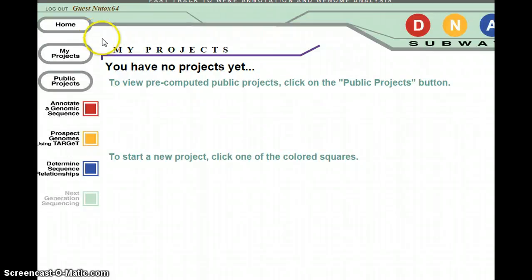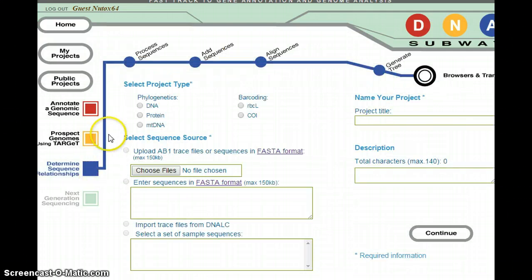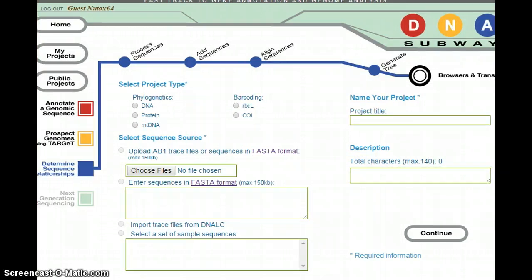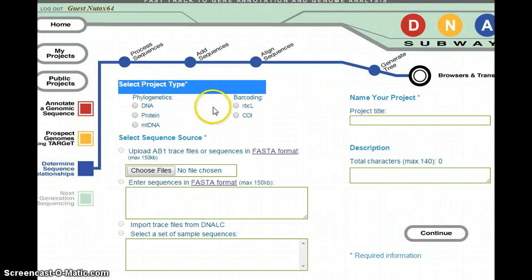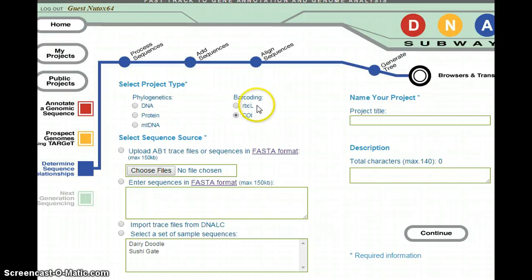The next screen will show you a little blue square down here that says 'Determine Sequence Relationships.' Go ahead and click on the blue square. Now you have a page that's going to ask you to input different information. First, under 'Select Project Type,' you want to click the button that says CO1, because that's the barcoding gene we're focusing on in this project.